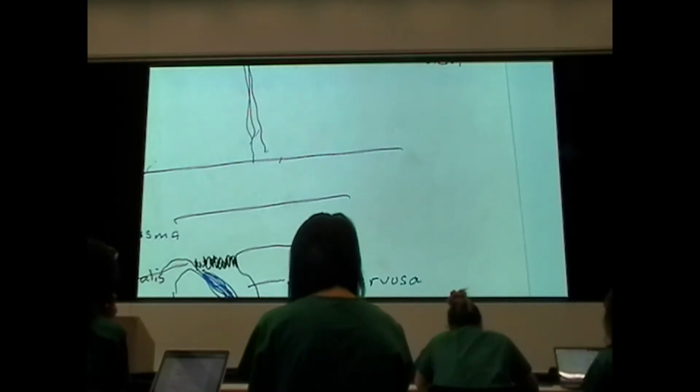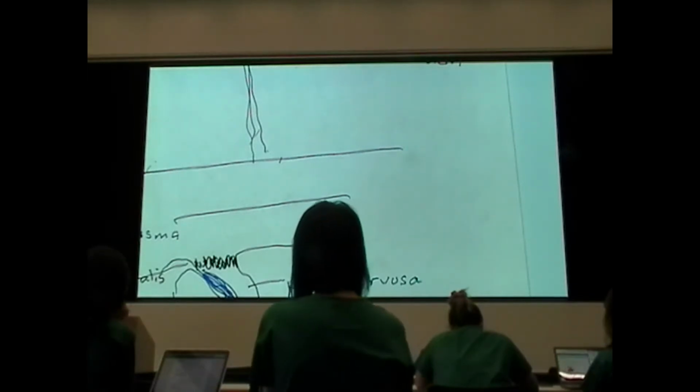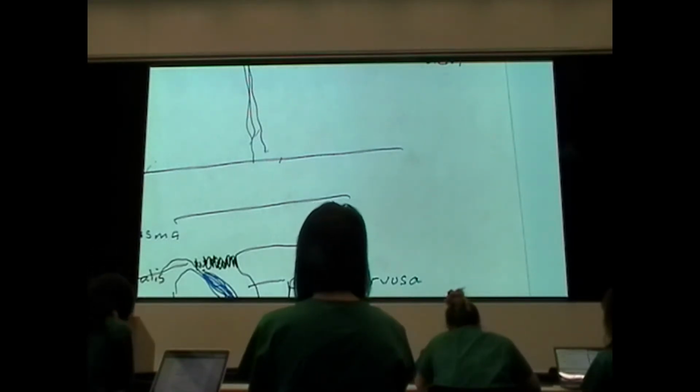These follicles sometimes contain a material which is called colloid, not to be mistaken for the material that's found in the thyroid gland, which we'll talk about in a little while. Pars intermedia is, in human beings, not a very clear-cut component.